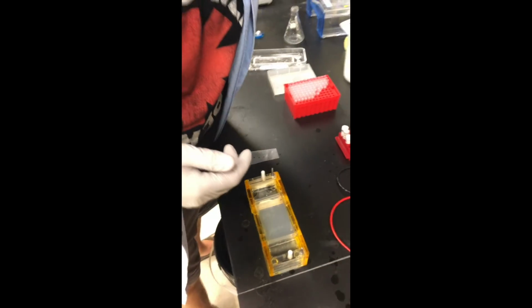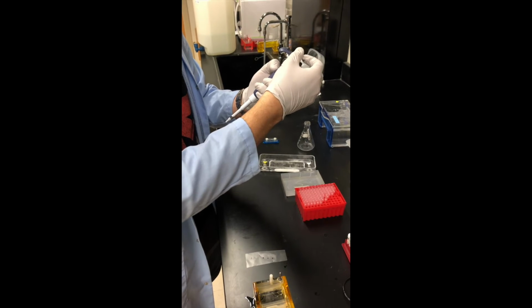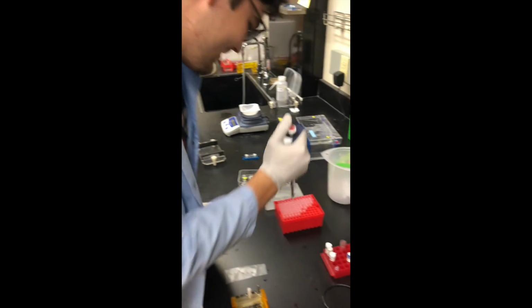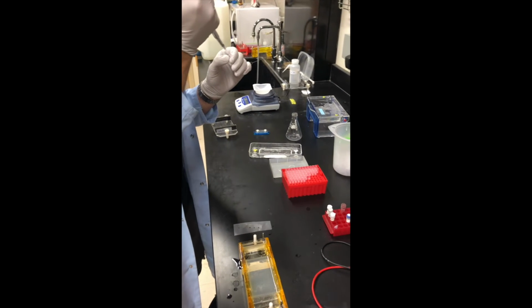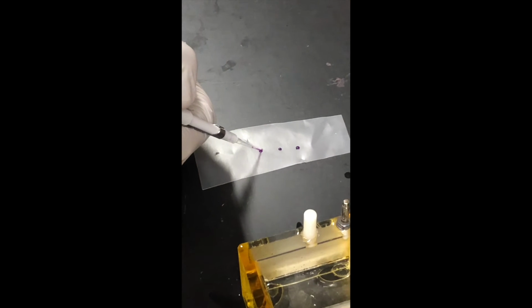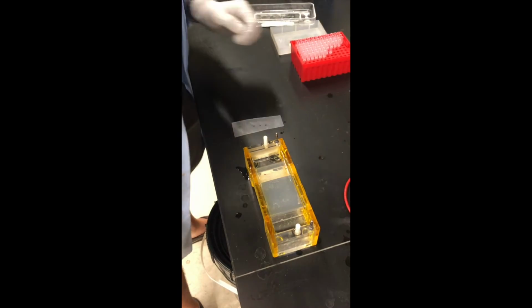So, going to want to use the P20 once again. Set it to 3. And then load away to your heart's content. So here's the deletion. So as you can see right now, Drew is mixing up the purple loading dye with our sample of DNA so that when it runs, we will be able to notice it because it will be purple now.